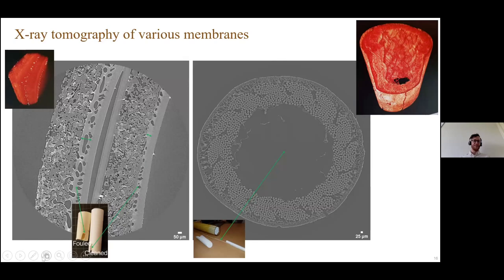Back to the membrane samples themselves. Here you can see we've already scanned different types of membranes - a tubular membrane and a hollow fiber membrane, a small spaghetti type. The sample was fouled with bleach plant effluent from a pulp mill. You can nicely see the surface, the non-woven support layer of the membrane, and the active layer. Here you can see the support layer inside this hollow fiber membrane and outside the active layer.